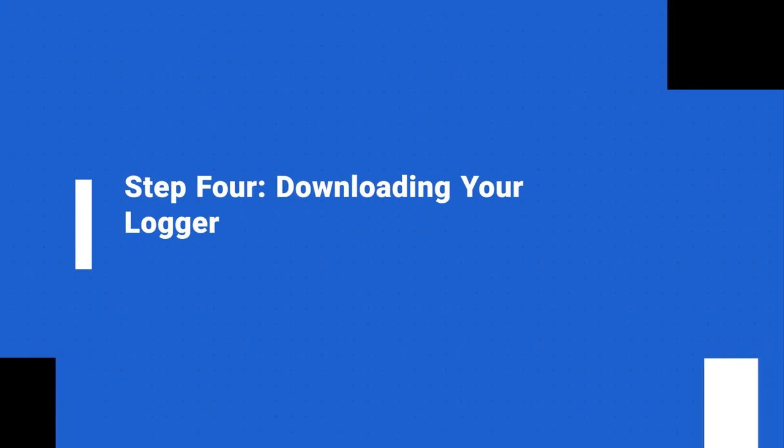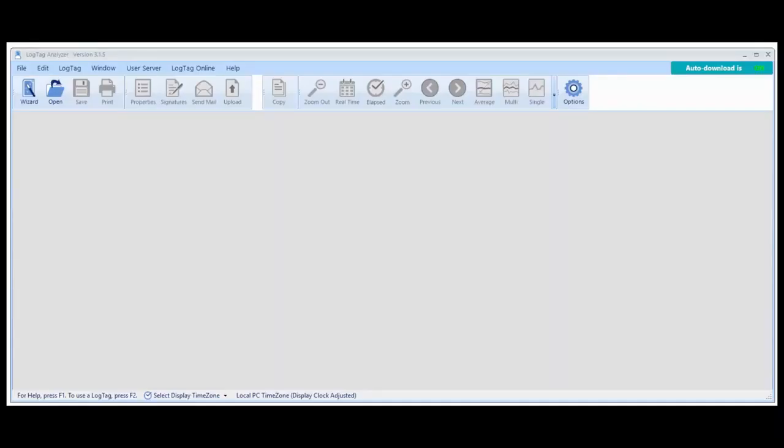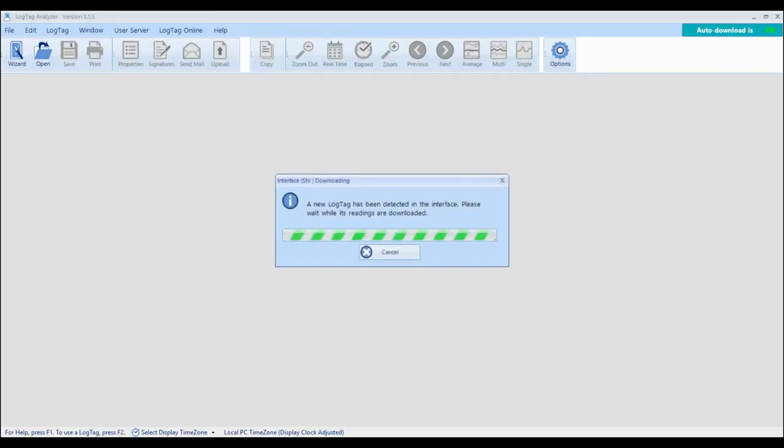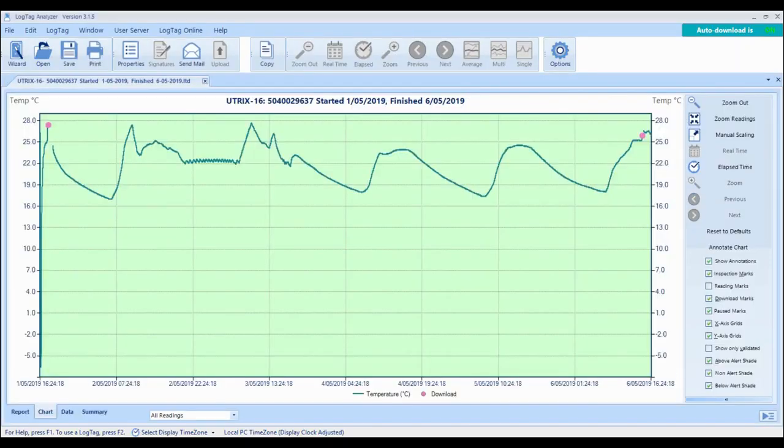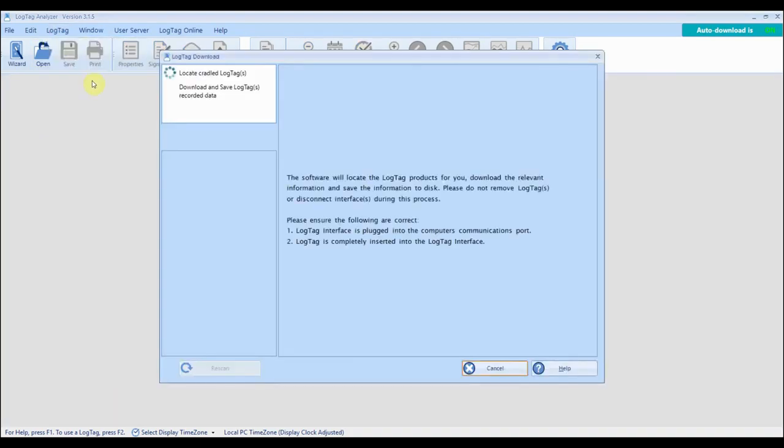To download and view your results open LogTag Analyzer then connect your USB logger to your computer. If auto-download is enabled LogTag Analyzer will automatically display a chart of your readings. If not click LogTag from the main menu then click download.